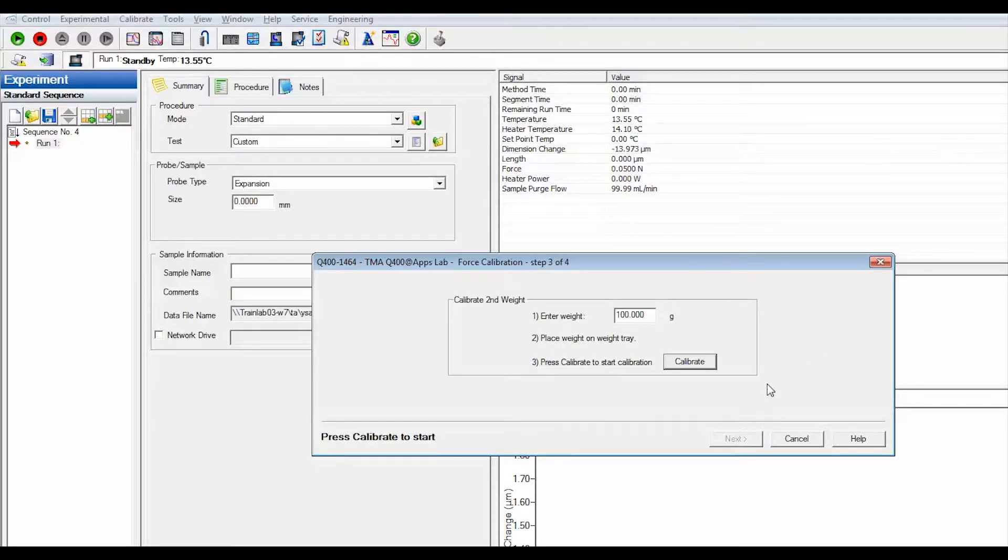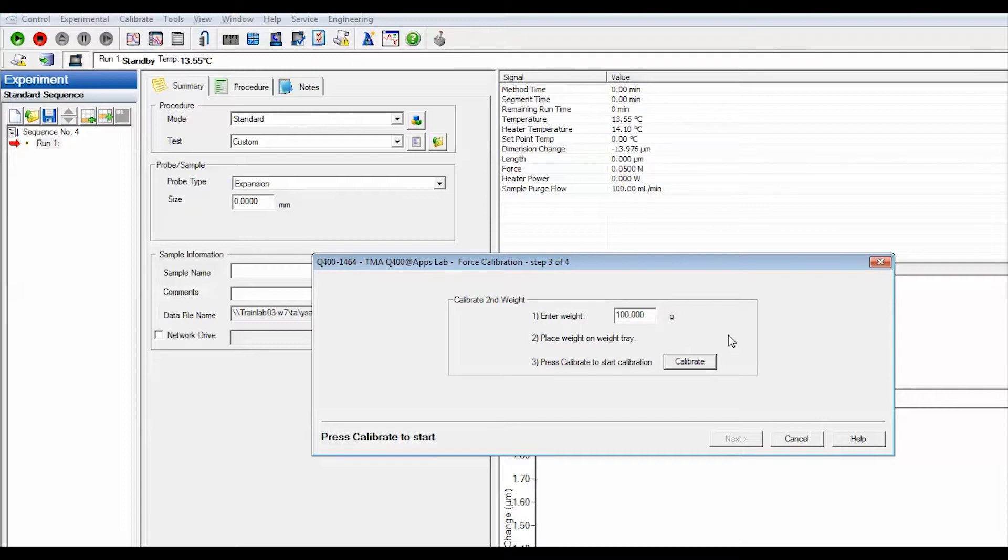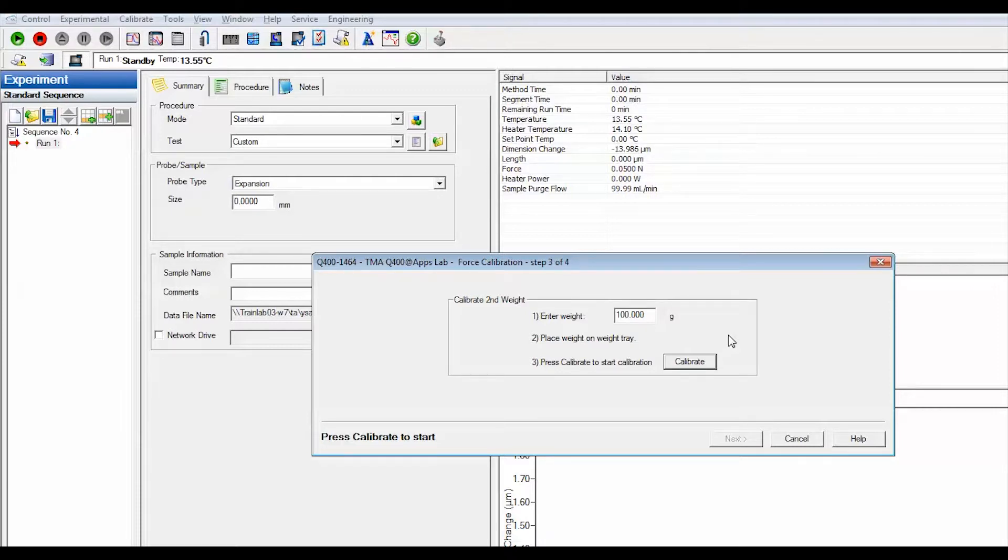For the second weight calibrate, the recommended weight amount is 100 grams. Enter the weight in grams of the standard you are using. Take into account that the second weight must be heavier than the first weight and must be between 10 and 100 grams.